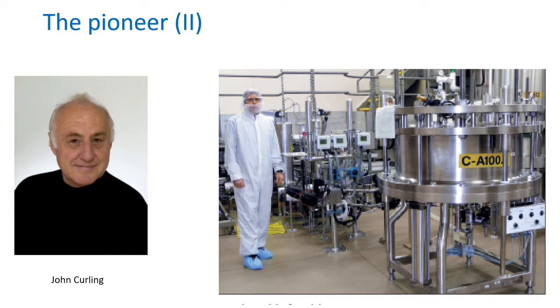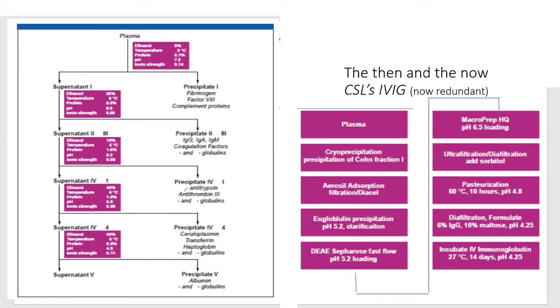In chromatography, we have these large columns, which you can see on the other half of the slide, which are packed with specific gels, we call them, which allow the separation of mixtures of proteins, such as are found in plasma, using several biochemical principles based on charge, based on size, and so on. And so we have these two main technologies.